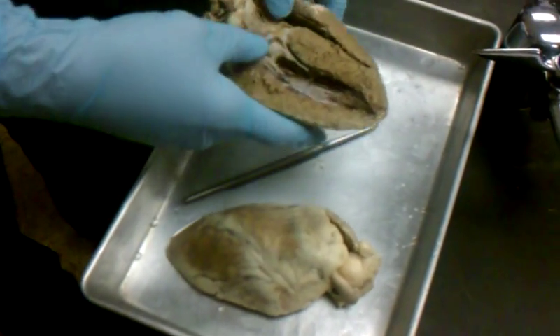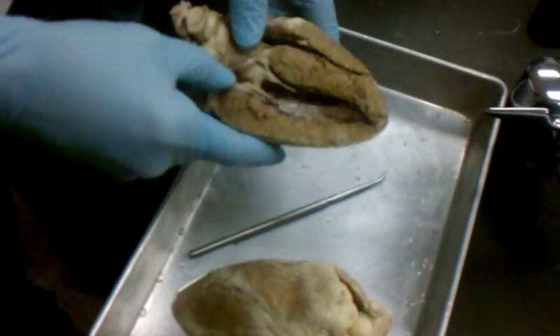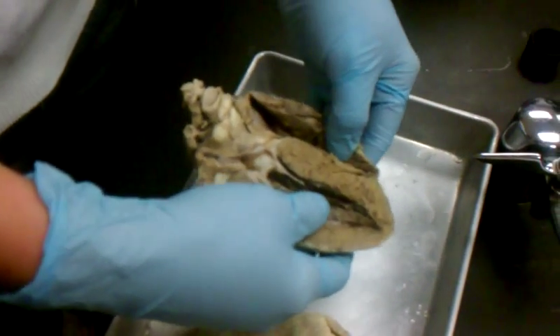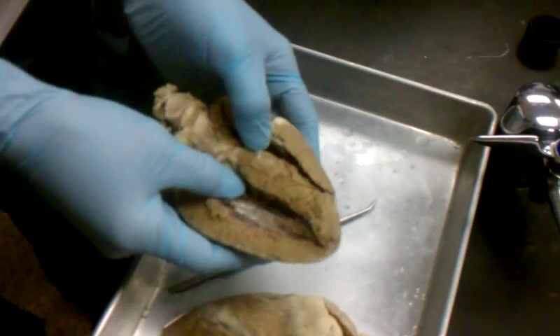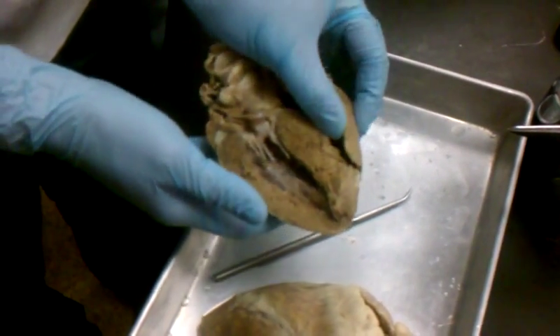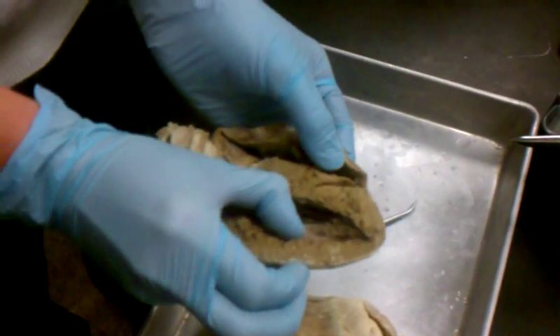Okay, so you have 4 compartments to the heart. What are the top 2? Left and right atrium. What are the bottom 2? Left and right ventricle. So how do you tell the difference between sides? The left side is thicker than the right. The left side is a lot thicker. So this is kind of cut weird, but that's the thickness of the right side. That's the thickness of the left side.